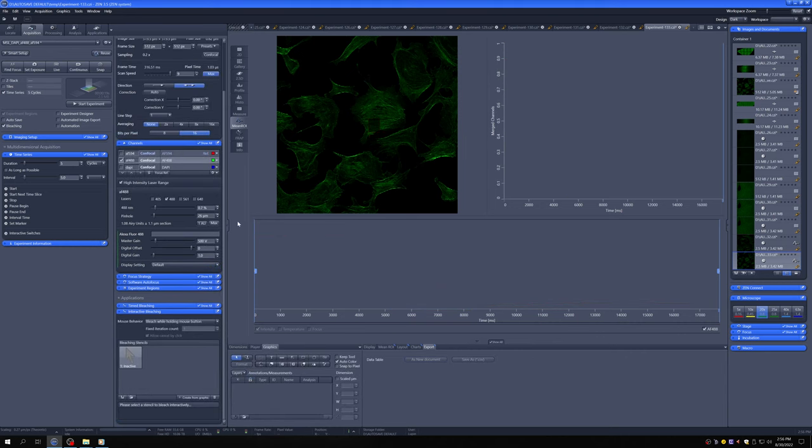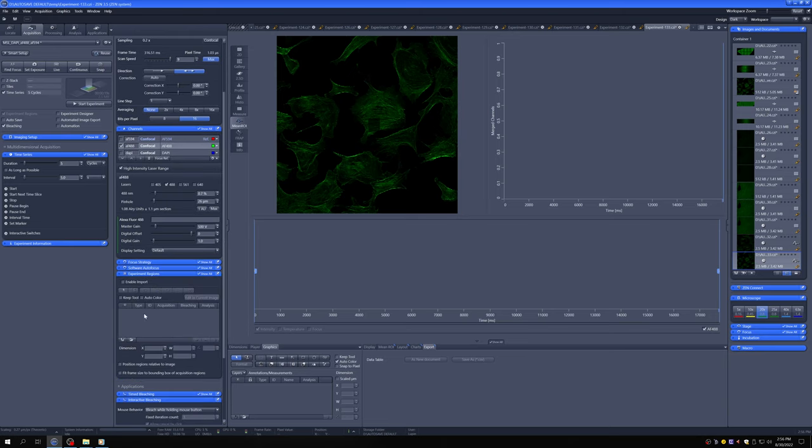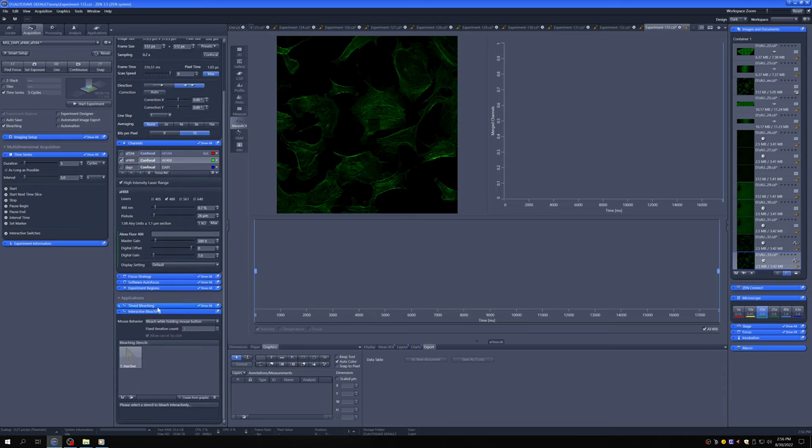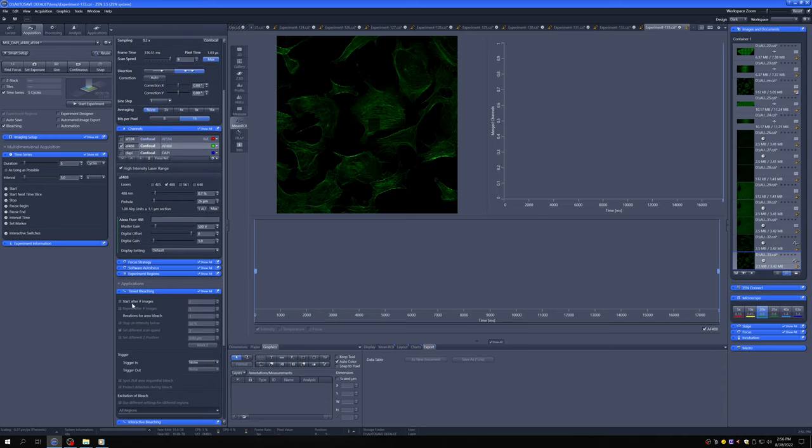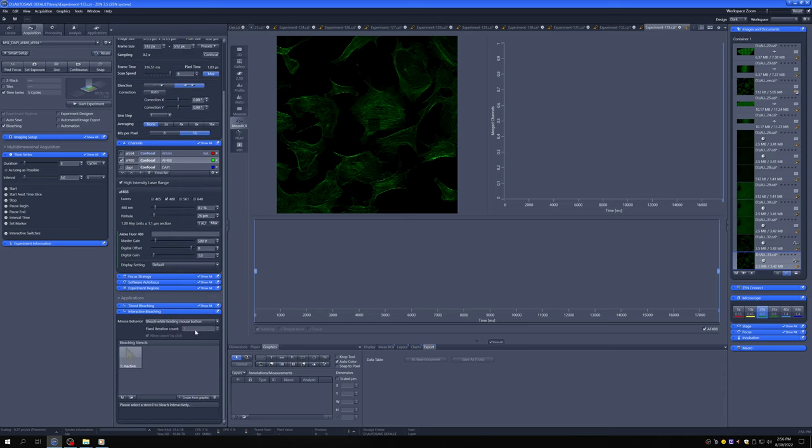The other way of doing bleaching is using, instead of the time bleaching, the interactive bleaching. And I've went ahead and deleted this, I turned this off so it wouldn't happen. And so now what we need to do is create a region from a graphic.